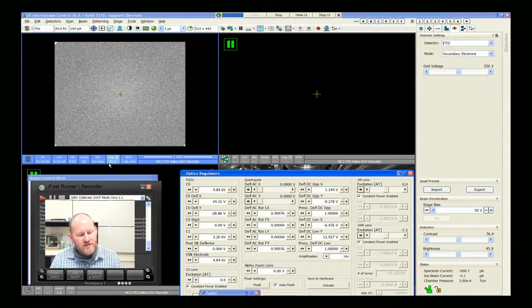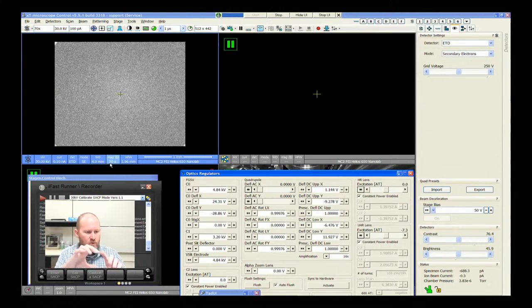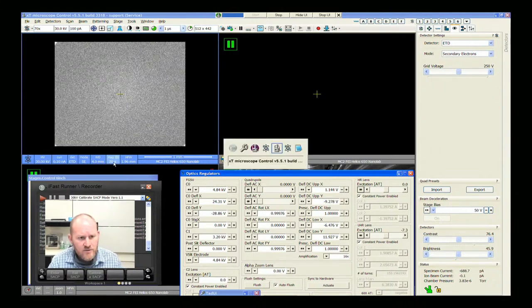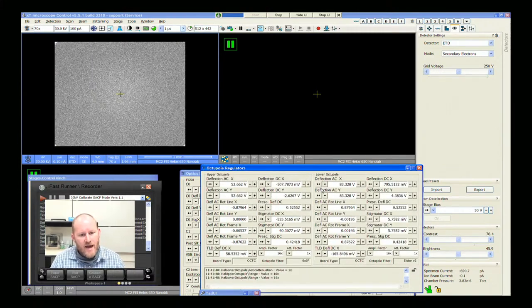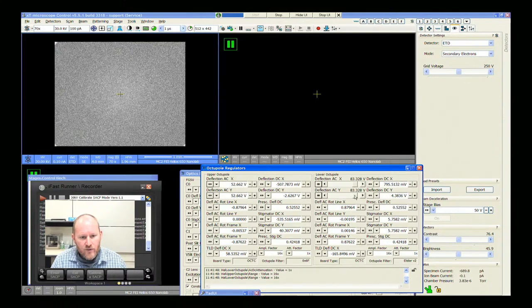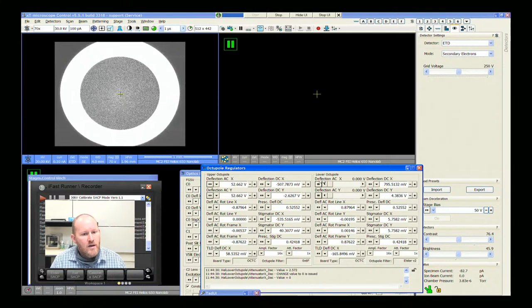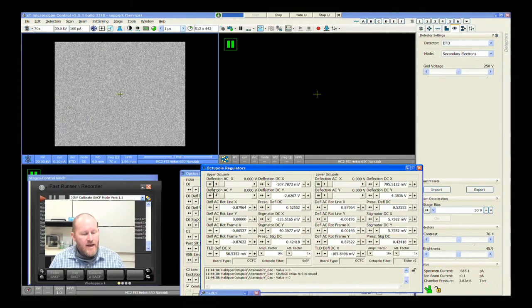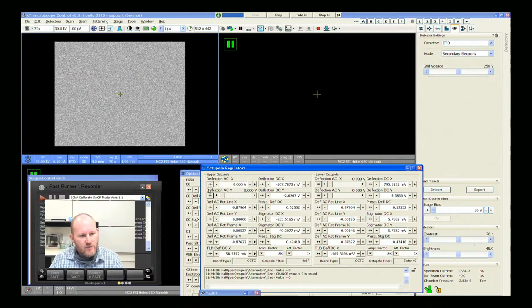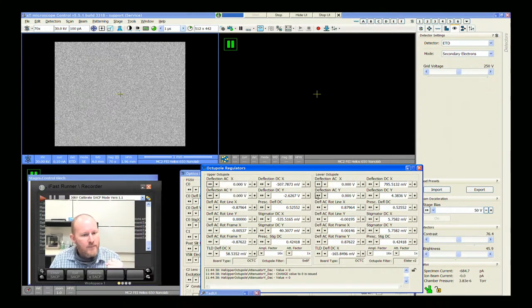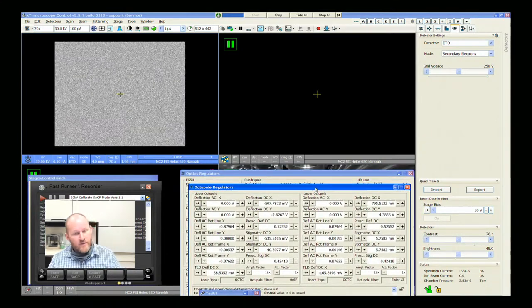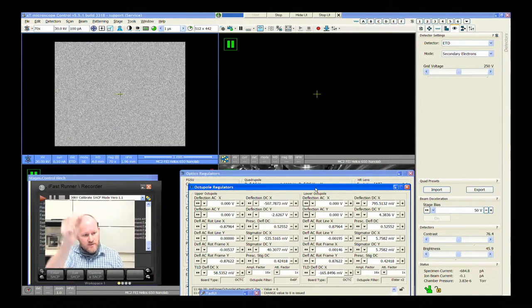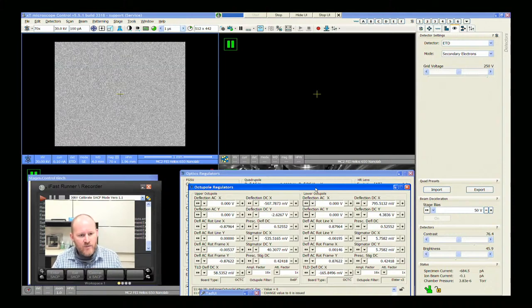We still don't see a pattern, and one reason is that the mag says 70 — we're scanning with the octopole coils down here, not the quadrupole up top. I'm going to bring up the octopole regulators. I could drag the deflection ACY for the lower octopole to zero, and then the deflection ACY for the upper octopole to zero — I've effectively stopped scanning with the octopoles. The other thing I can do is just turn the mag knob way up. At this point we have, we're focusing with C1, but the beam is just static straight down the column because the octopoles aren't scanning and we haven't yet set the quadrupoles to scan.